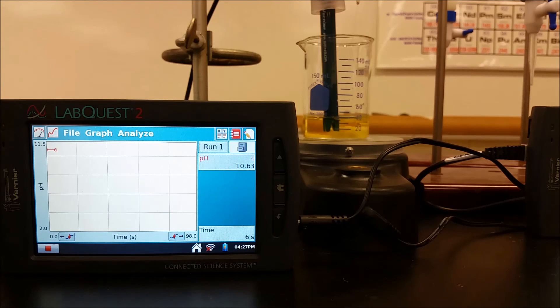And so therefore, if we weren't using a pH meter, we would get a good set of information to figure out what the unknown concentration of something is. So right now we're into our buffering region. We just started adding the strong acid to it. And our color is staying the yellow that it's supposed to be, probably around the half equivalence point right around now. So we have a very flat slope.